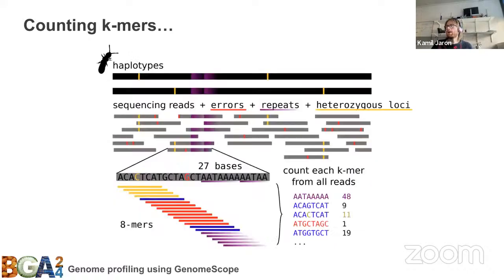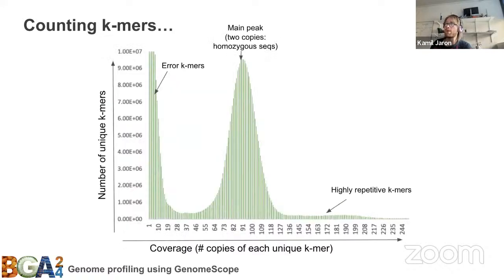Right. So we were talking about how the k-mer spectra looks like for a diploid genome that has no heterozygous loci, and that's actually very unreal. So what would it look like if we added just one last thing? I hope it will be no surprise to you at this point that it will just generate one more peak in between 0 and the 2n peak. It's the 1n peak. It should be exactly half of the coverage.